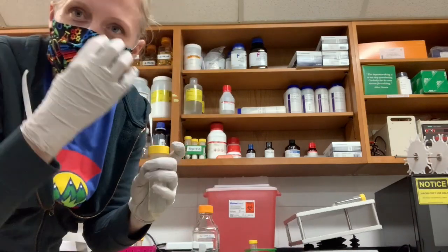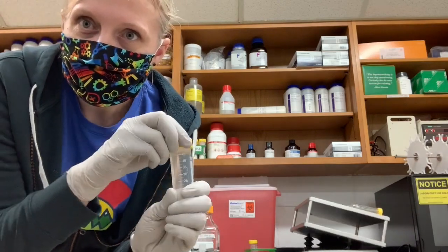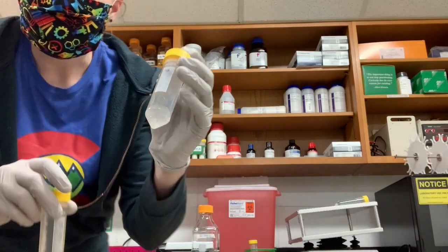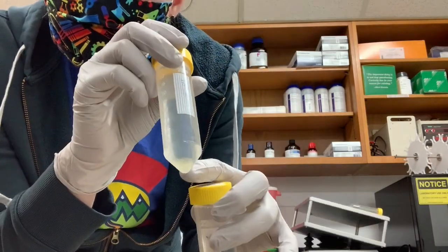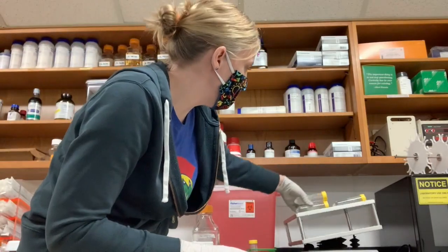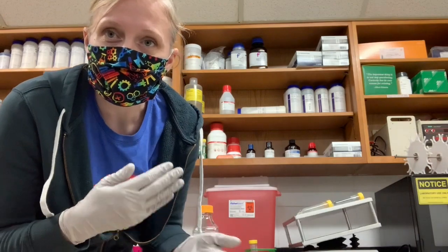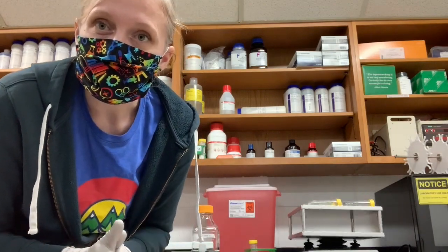You'll notice I'm putting that right at eye level so I can see the liquid level really well. And so after these detergents have been added, you'll see that the detergent will be just still at the bottom. And these can be also placed on the shaker and allowed to shake either for a little while or overnight. And then you'll see that the solution has been well mixed and these will be ready to go.